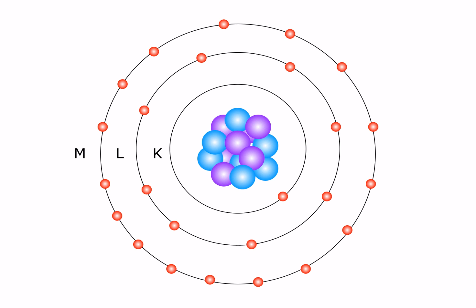Now, remember how I mentioned earlier how all those other electrons want desperately to be in a more internal electron valence shell? They all make a run for this brand new deluxe opening near the center of our atomic city. They start moving around, and finally one is able to cross that energy barrier and snap into place. And once it does so, it drops from one energy level to another.